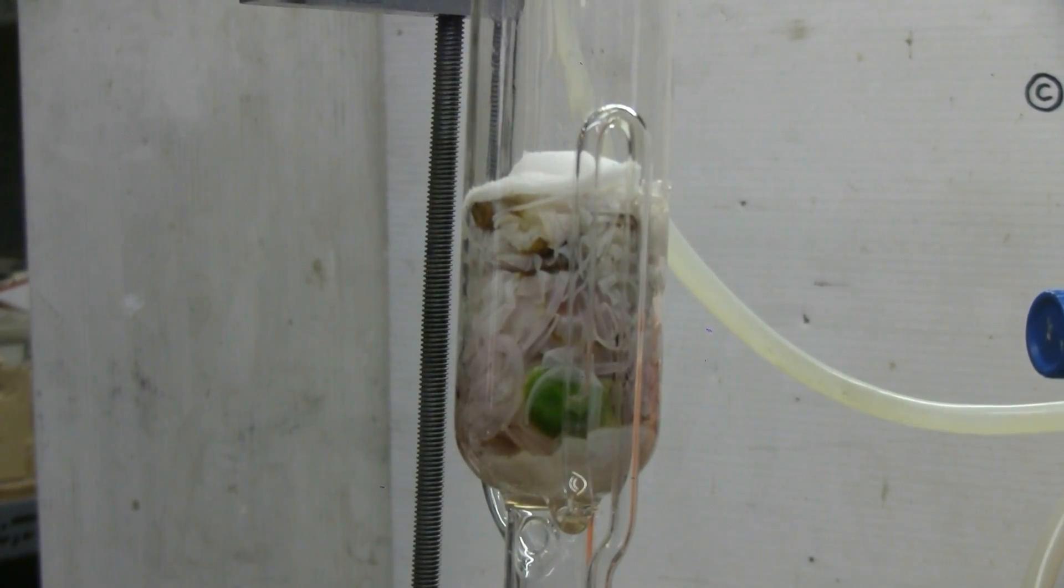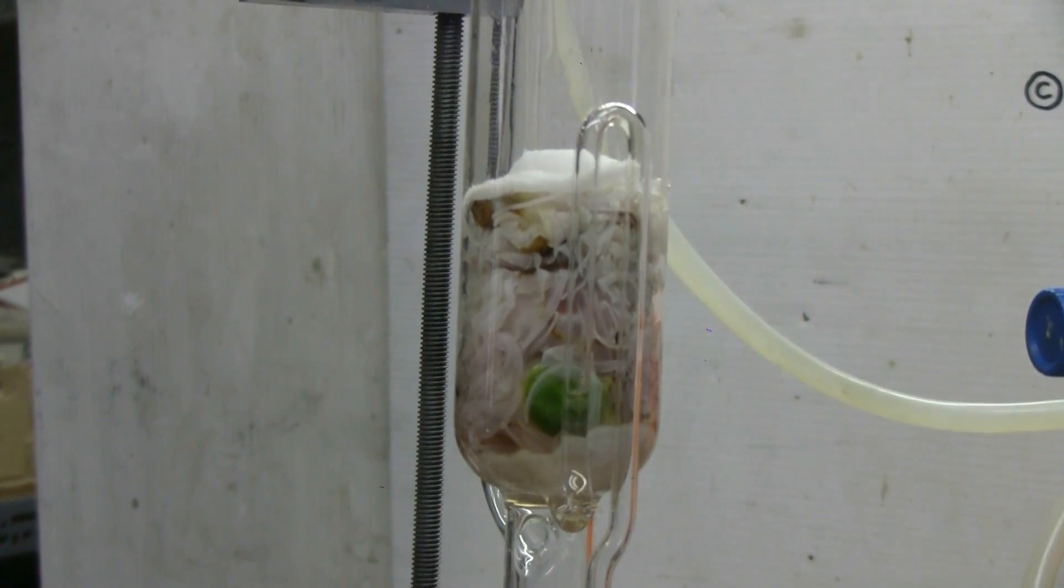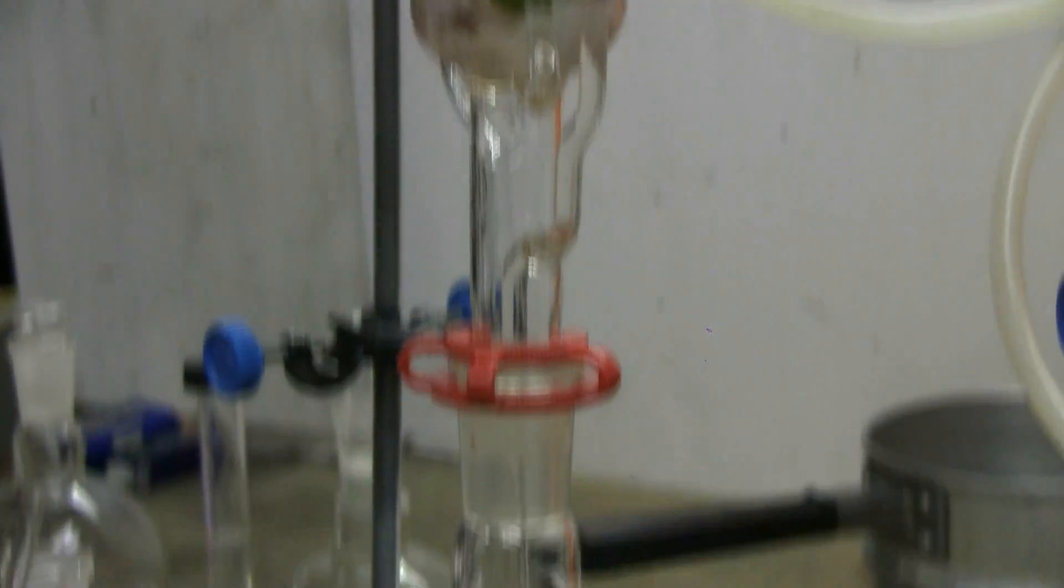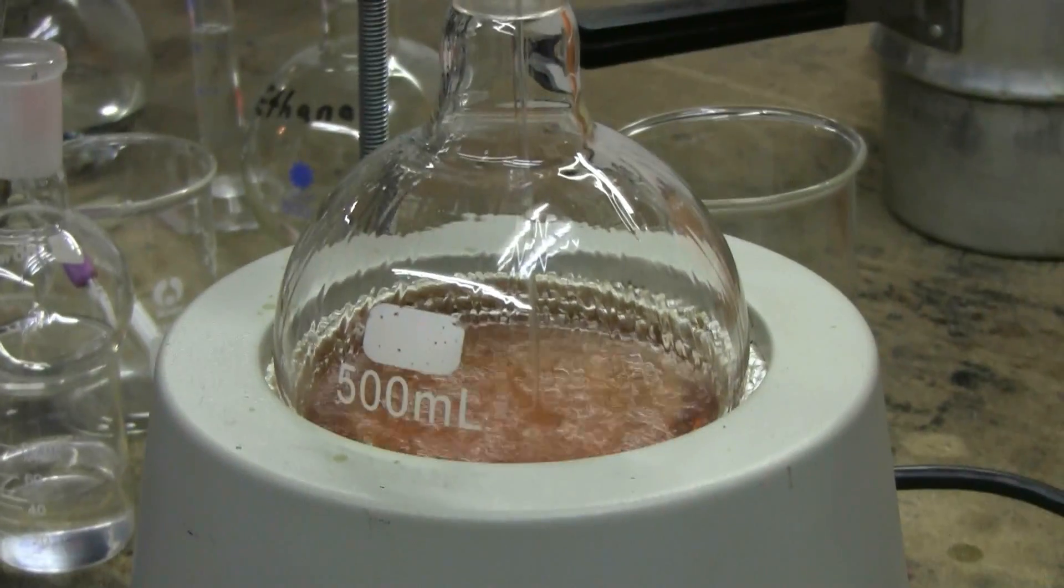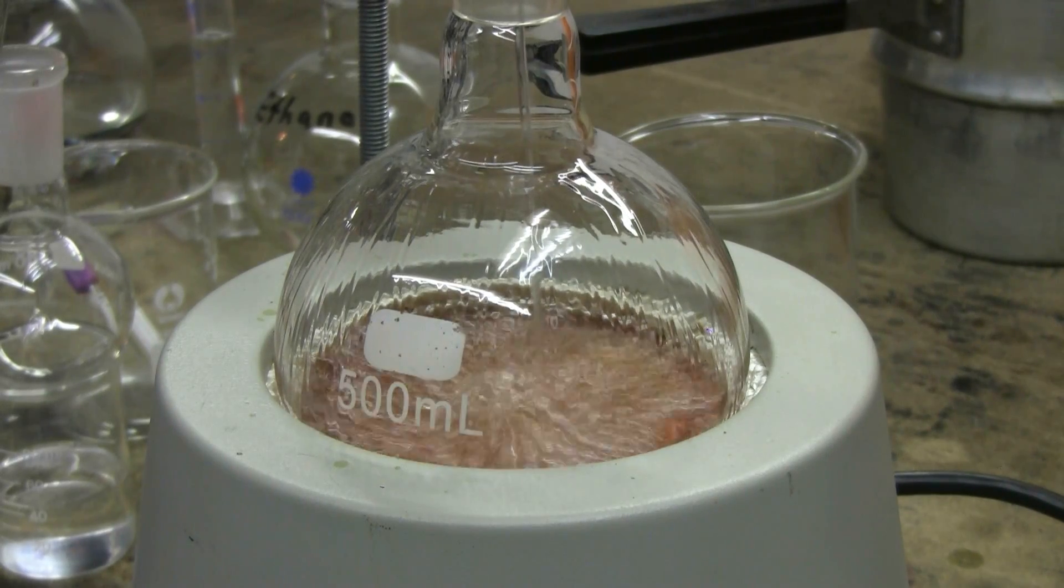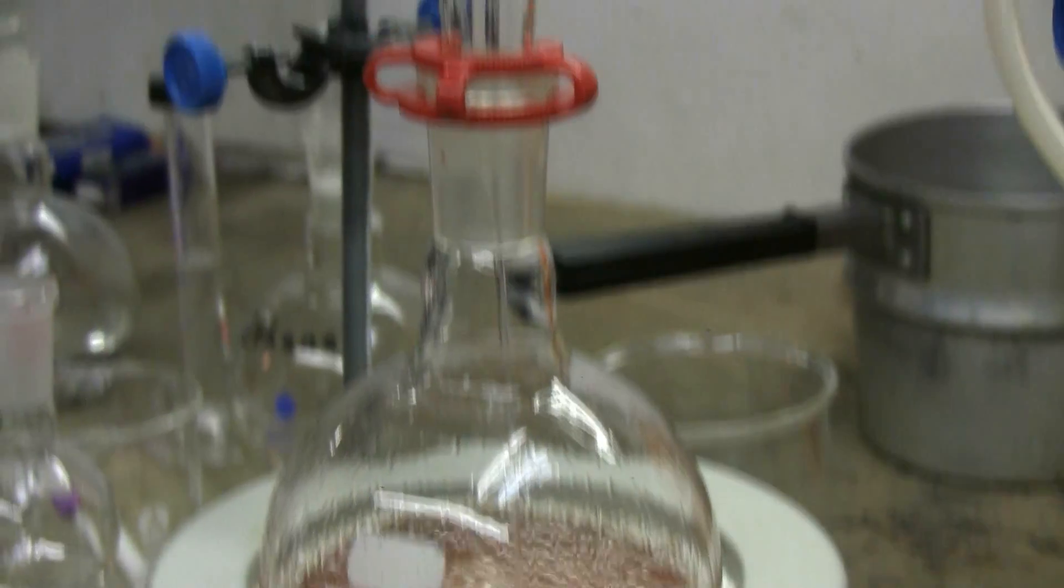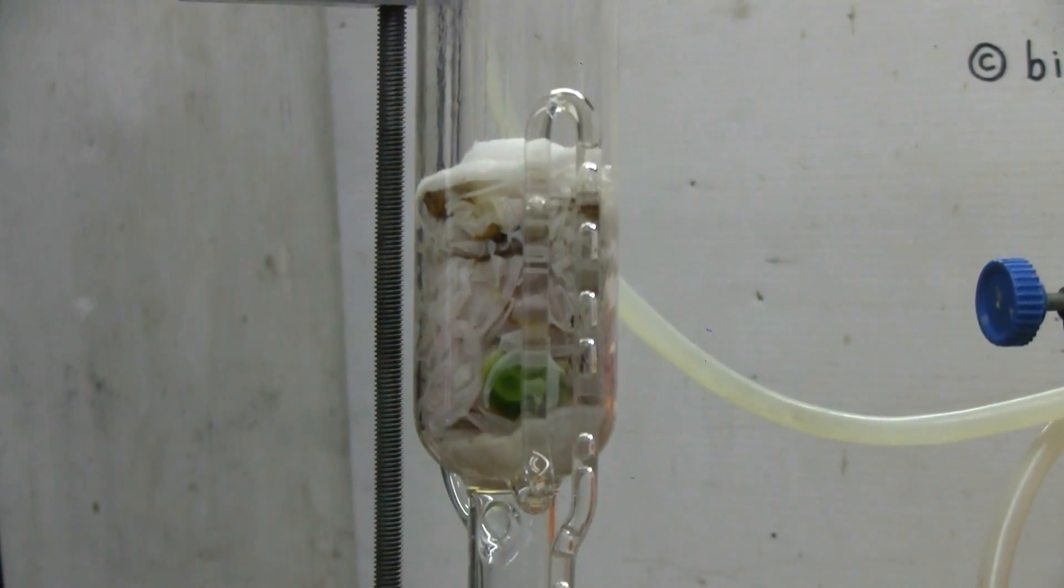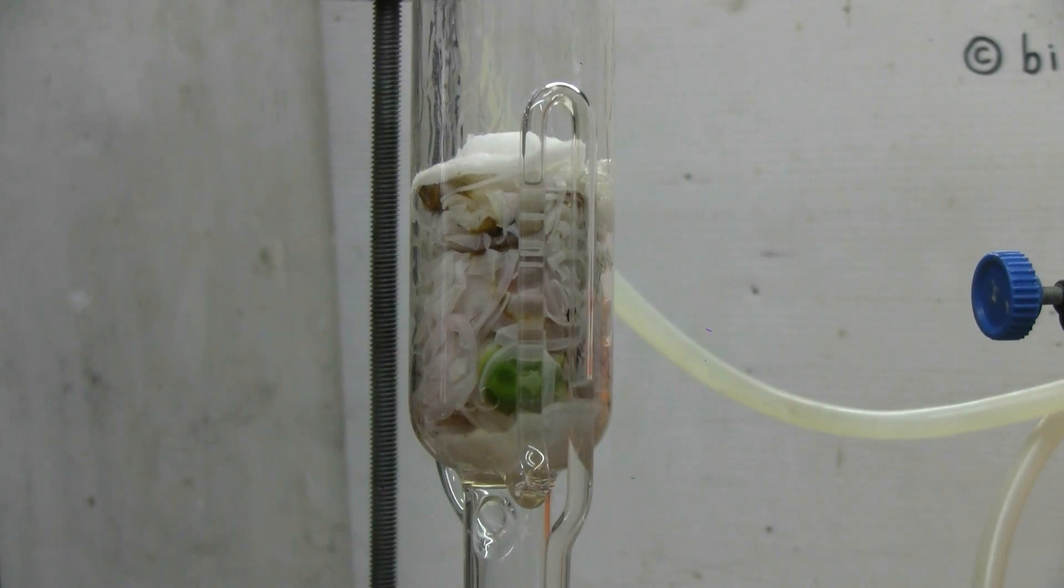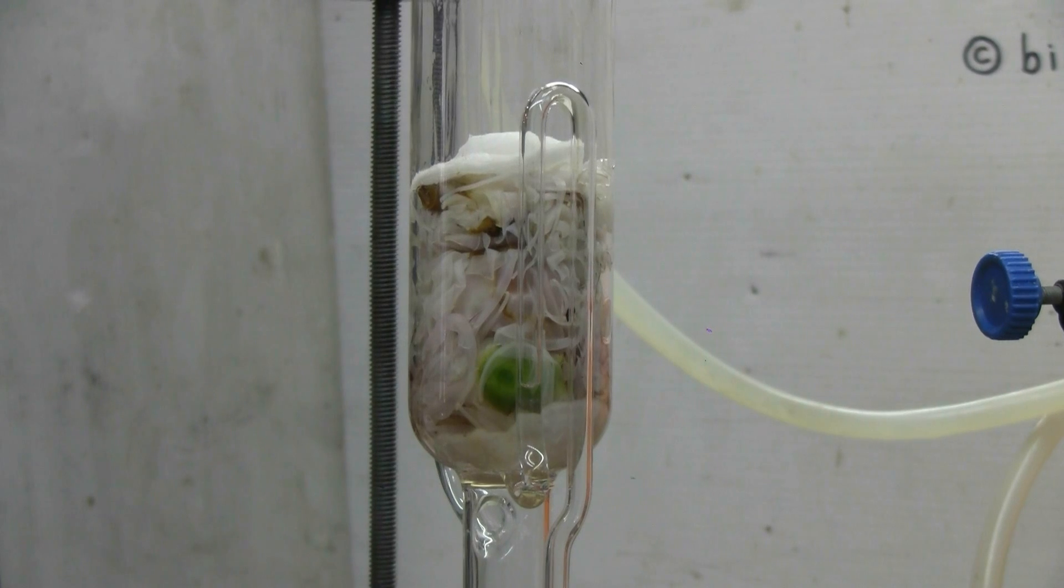Cycle number three will now begin. Here goes the third cycle. Nice rosy color of extraction in the boiling flask. Third cycle is completed. I'm going to do ten cycles, so I'll pick up the video again when we reach the last cycle, number ten.